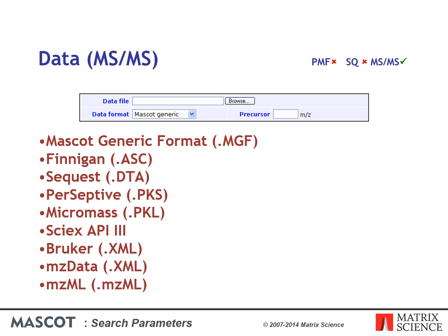A data file may include embedded search parameters. Most embedded parameters can appear only once at the head of the data file. In a Mascot generic format file, a few parameters can appear within an MSMS dataset. See the data file format help page for further details.